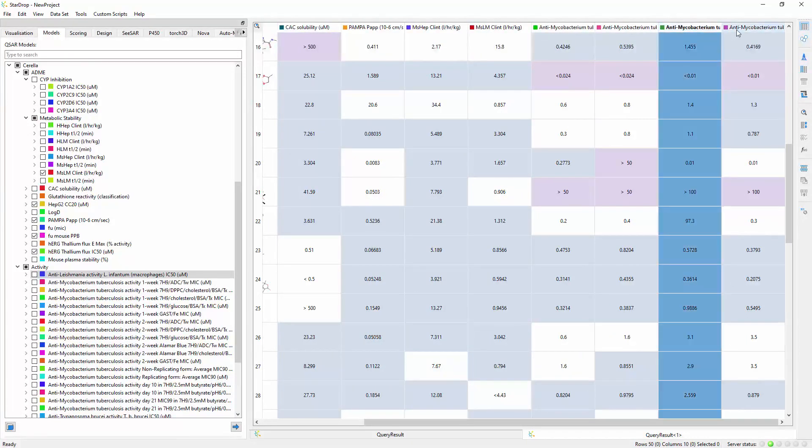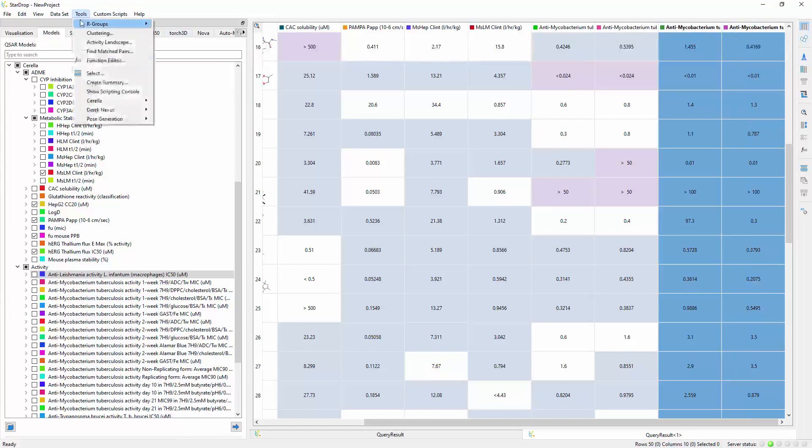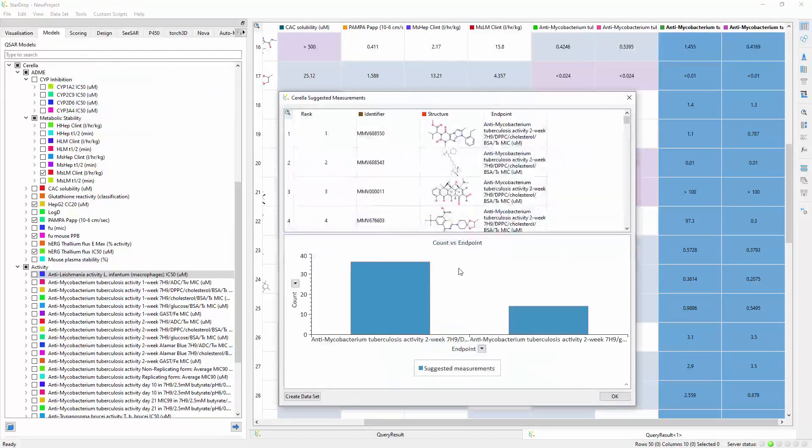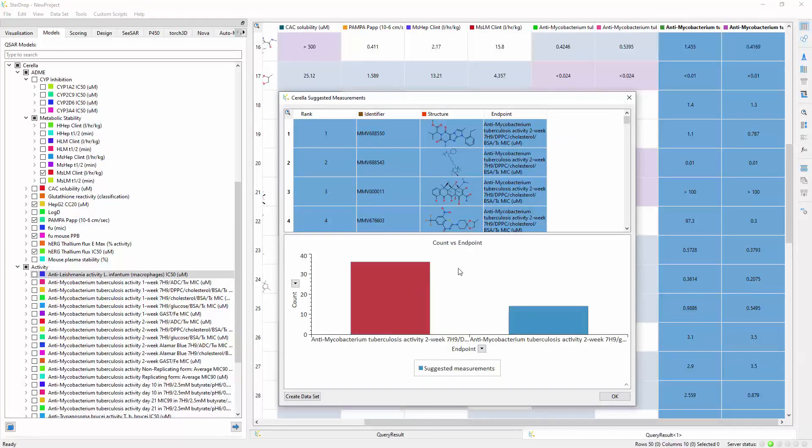Here we choose two target assays, and Cirella suggests the most valuable early assays to run, and which compounds to measure. This ensures that you will get the most value from your experimental resources, and choose the best compounds to progress.